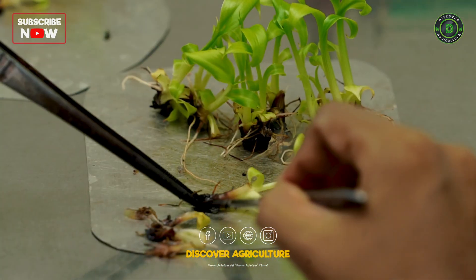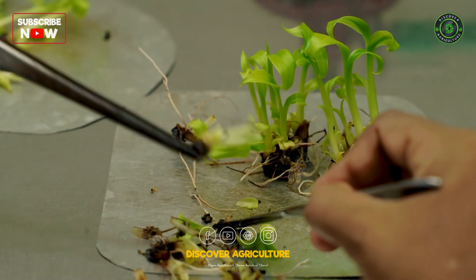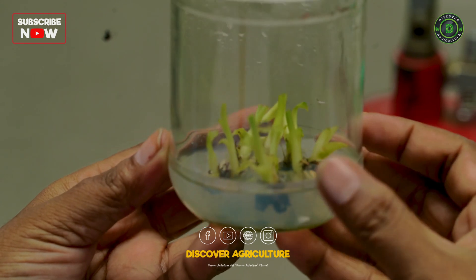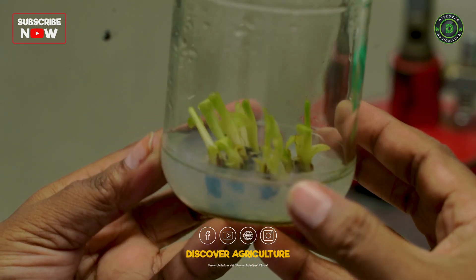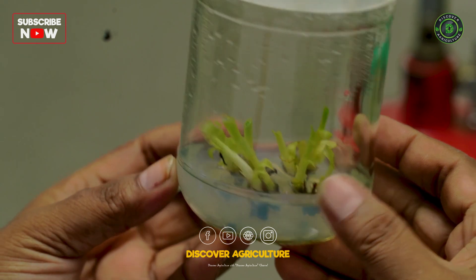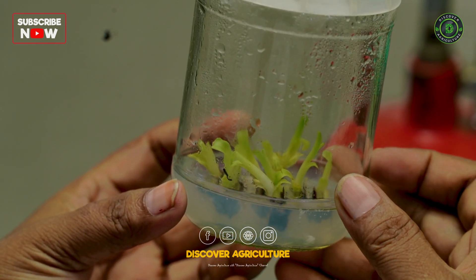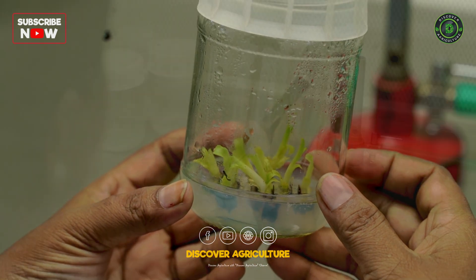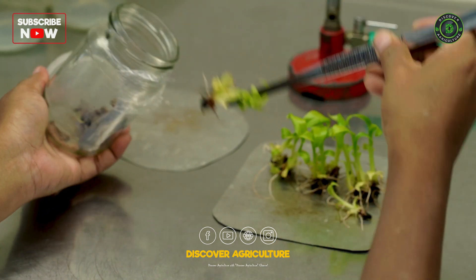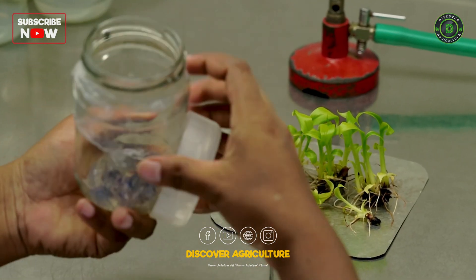Stage 2: Multiplication. After 15-20 days, the shoot tips are transferred to multiplication media, where they proliferate and multiply due to the presence of growth hormones like auxins and cytokinins. Typically, benzyl aminopurine is used for shoot proliferation. Over the course of 3-4 subcultures, you can achieve rapid multiplication, eventually producing hundreds of new shoots.